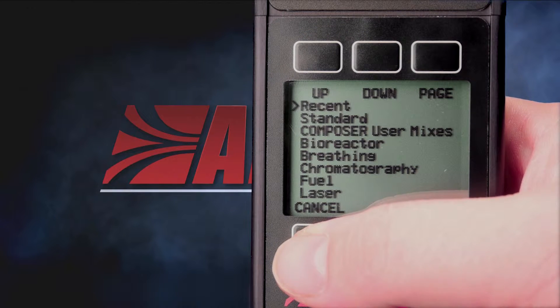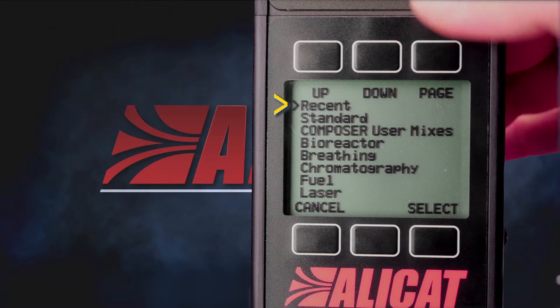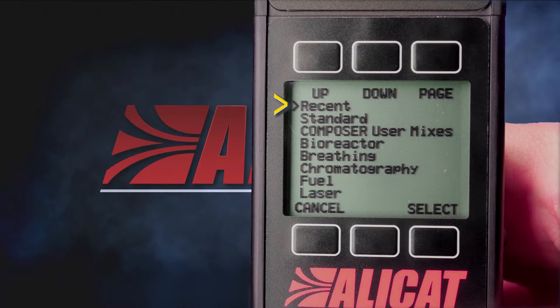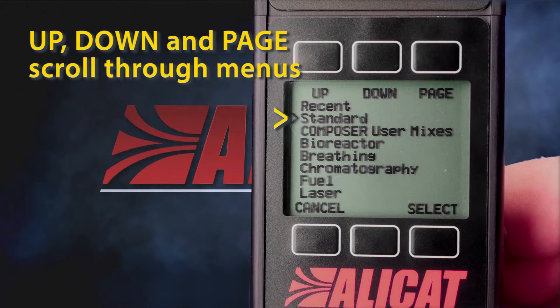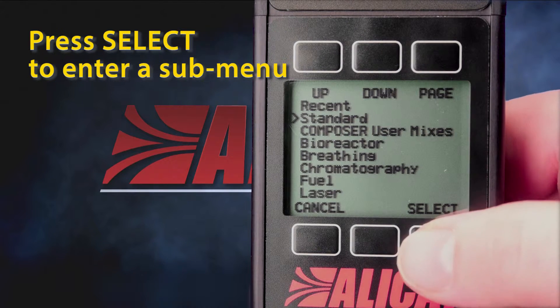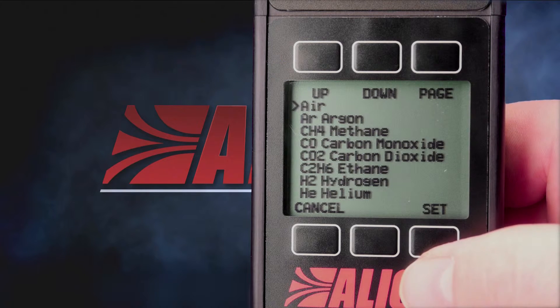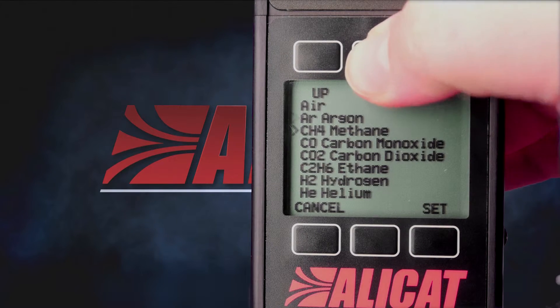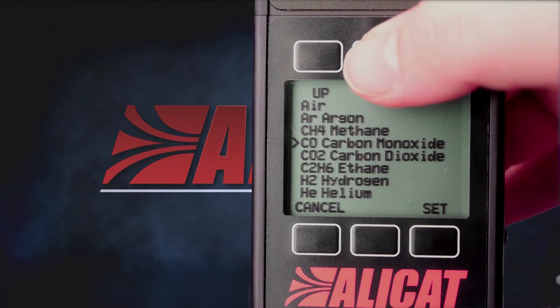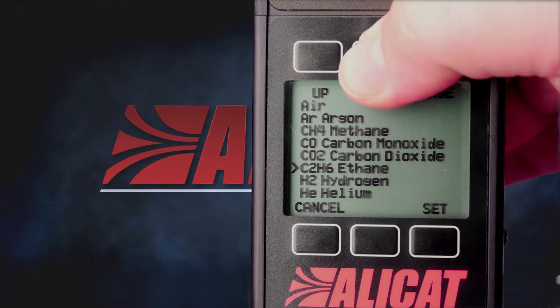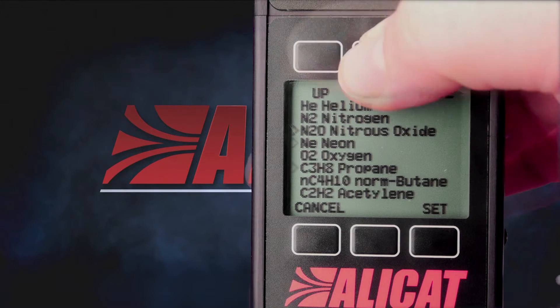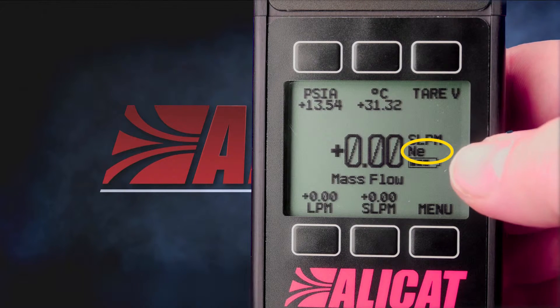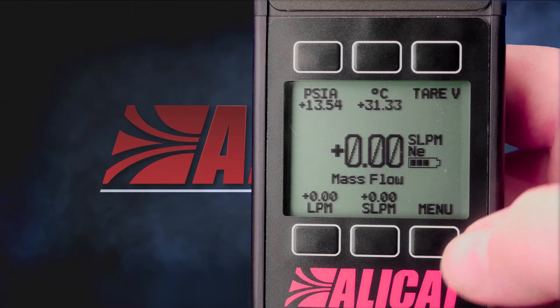We see our list of categories of gases. Our first choice is a recent option where, saved in the memory, we keep recent gas selections that the user has used. Right under that, our second choice is our standard gas select menu. Let's go to the standard gases and see what's there. Here we have the standard gases that are selectable from this menu — air, methane, carbon monoxide, etc. We'll go ahead and scroll down through the menu and select Neon. Now we can see that Neon has replaced air as the central selection, and the gas select is set to Neon.